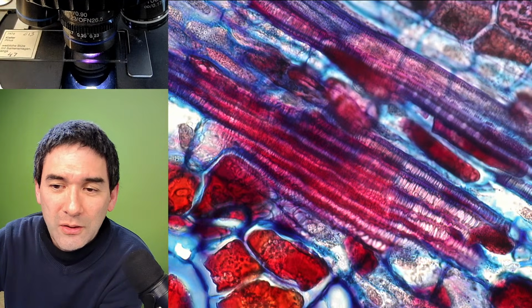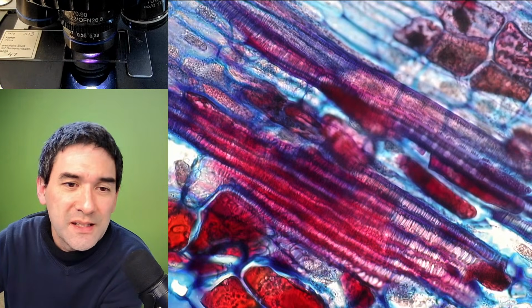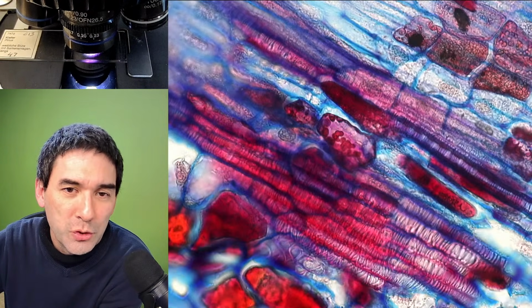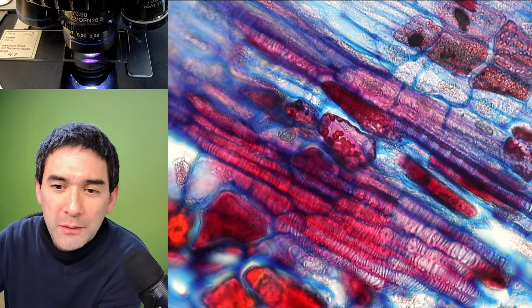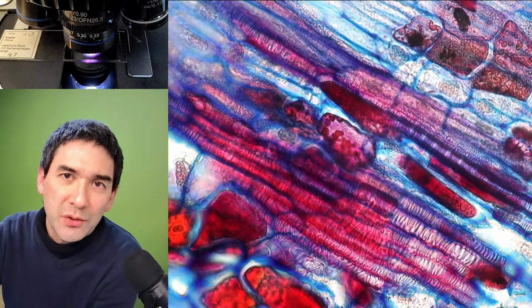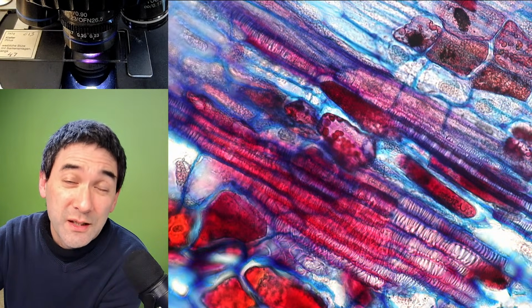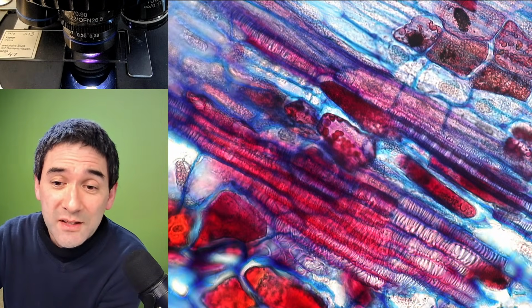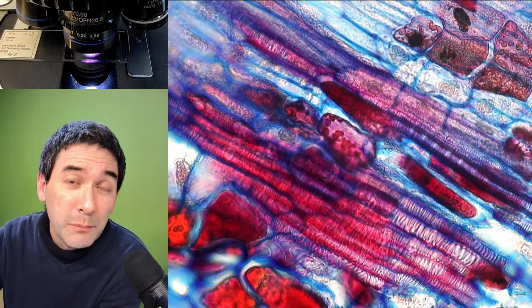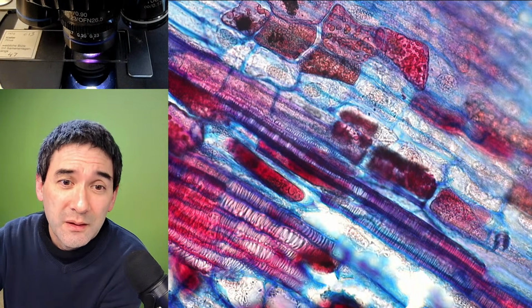Yeah. So there's some comments here. What I use for ringing slides is I found indeed nail polish to be quite effective here, but you have to thin it down a little bit using acetone. I think very often the fresh nail polish is still very thick, so acetone or nail polish remover, a couple of drops to the bottle will actually make it flow better.